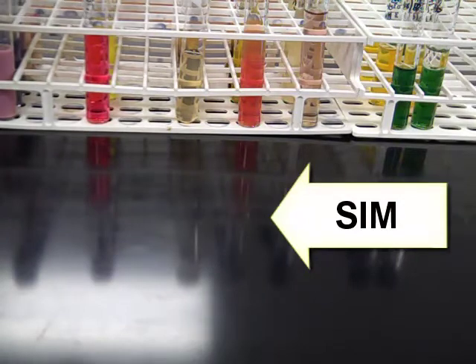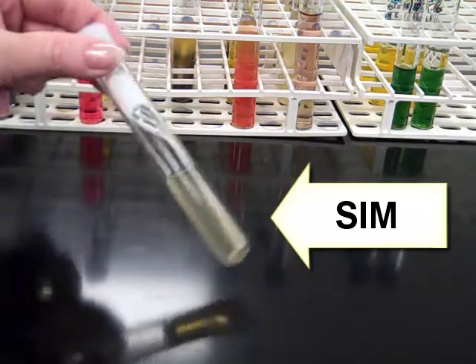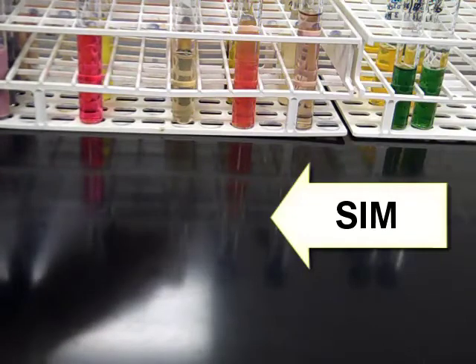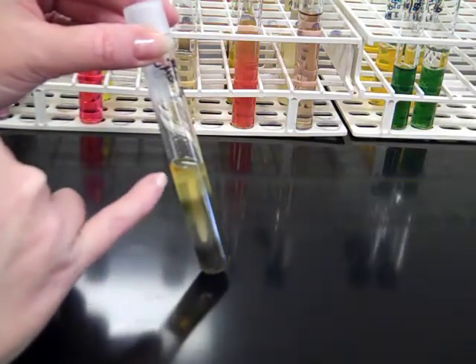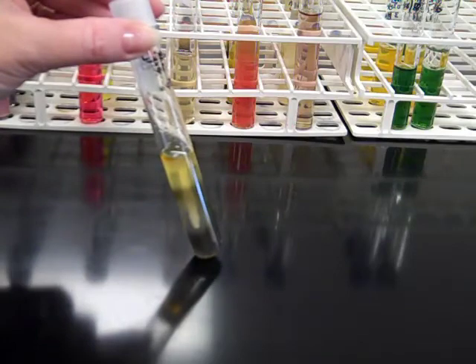The next tube we're going to be assessing is motility — this is SIM motility. It's a semi-solid when uninoculated. We use the needle to do a stab inoculation, and we're looking for, under the motility aspect, whether or not we can see a fuzzy line or fuzziness associated with the stab line. If we see the fuzziness, it is positive for motility.